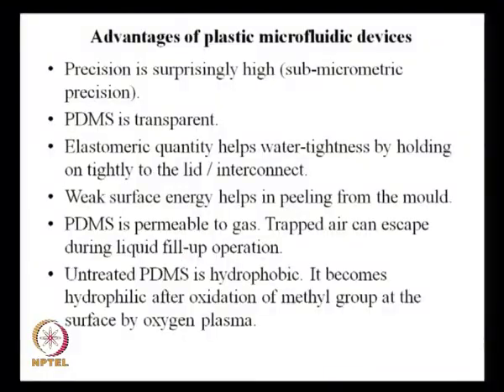However, PDMS can be made hydrophilic after oxidation of the methyl group at the surface by oxygen plasma. A common method is that you take the PDMS material, put it in a plasma asher, a plasma chamber, and use oxygen plasma to treat the surface.